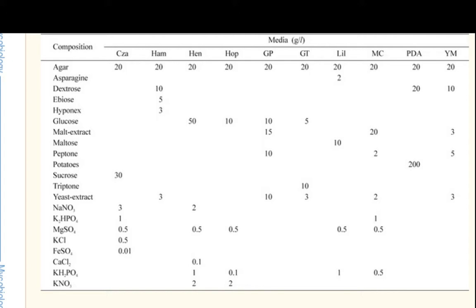And what I'm also going to do is two different types of growth medium. The first will be potato dextrose. I'm looking for the corn sugar. I haven't found that yet. The second one is going to be potato dextrose, but not with the corn sugar, or I'm going to do a half and half of corn sugar and honey.